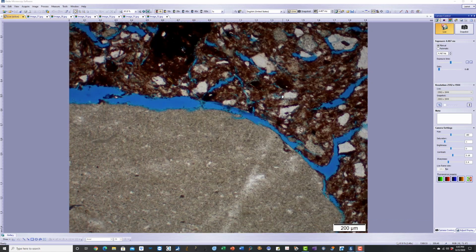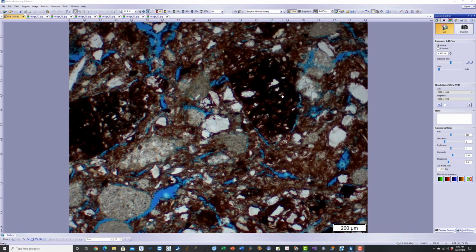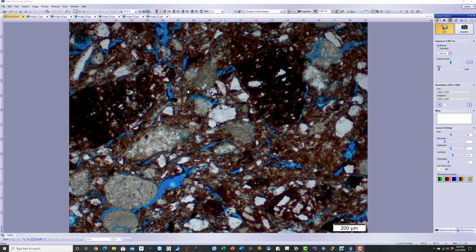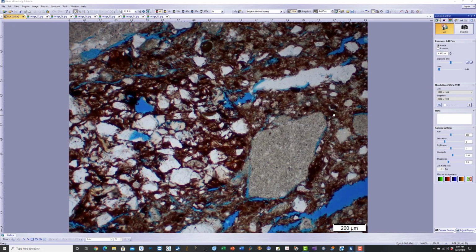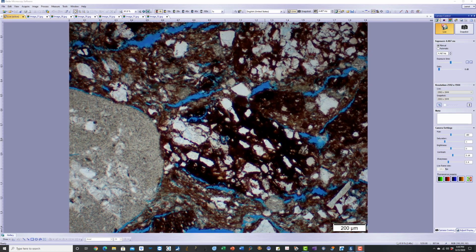When you look at the non-plastic component, we determine how many populations of tempered additives there are. Like when sand is added, in this particular case you see one grain size of sand, one population of tempered sand additive, and then the other population is the coarser particles, which comprise mostly the grog particles. These are the grog particles of previously fired brick. There is another grog particle.